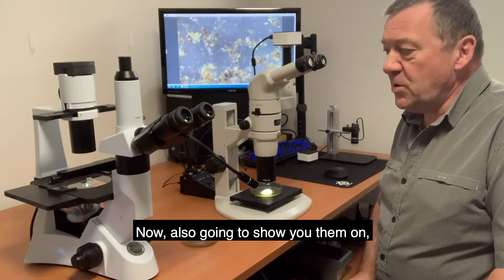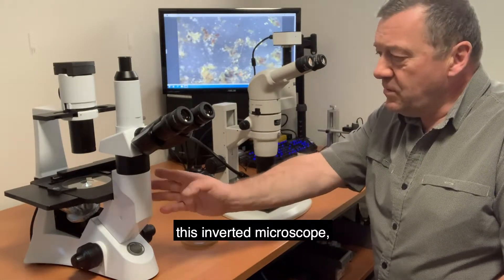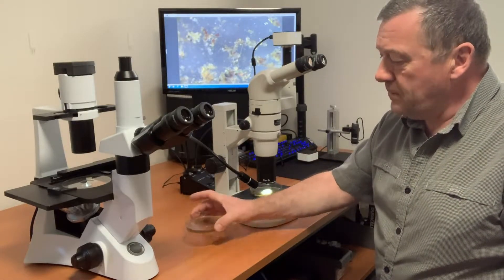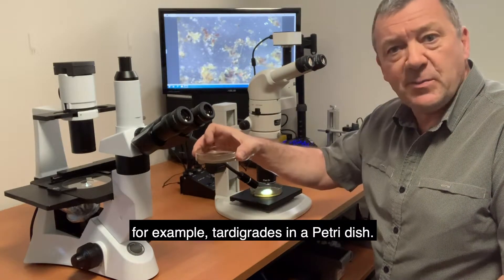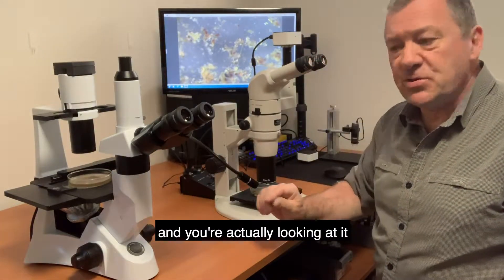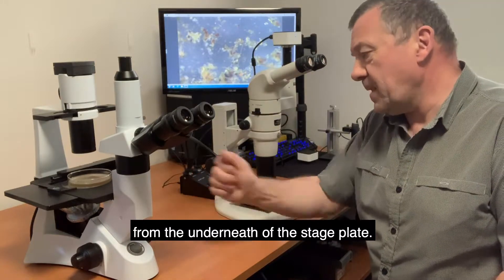I'm also going to show you them on this inverted microscope, sometimes referred to as an upside-down microscope. These are beneficial if you're looking at, for example, tardigrades in a petri dish. You put it on the microscope stage and you're actually looking at it from the underneath of the stage plate.